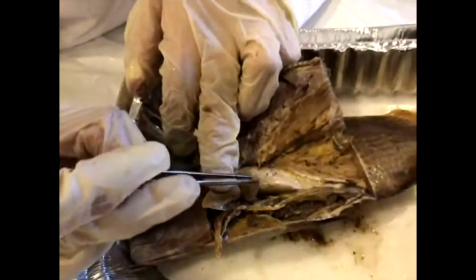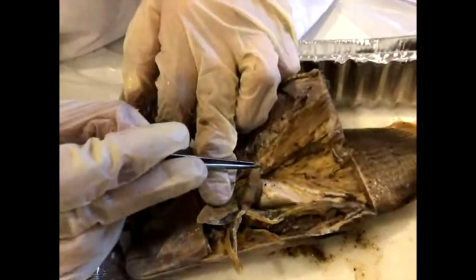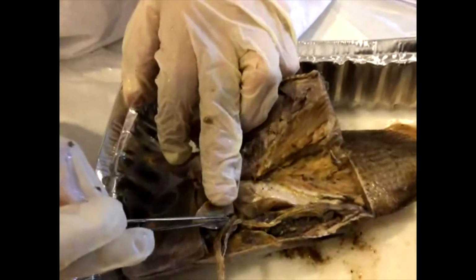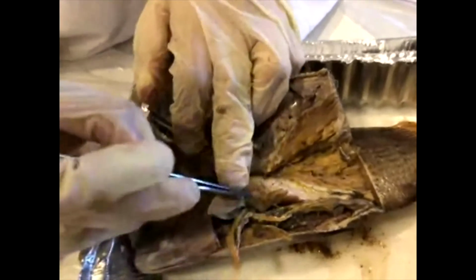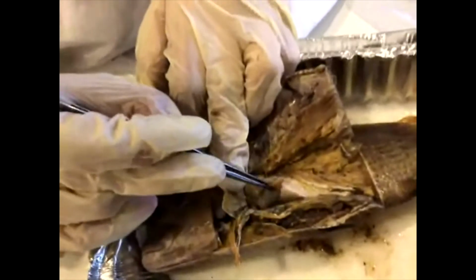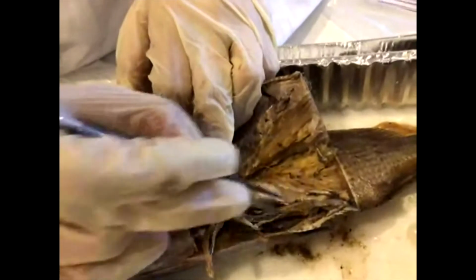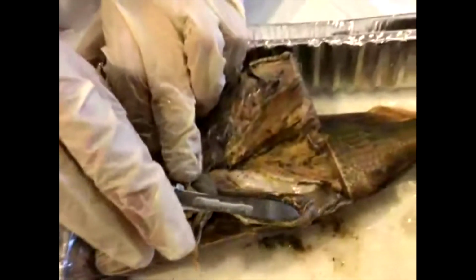So this in theory could probably expand quite a bit more if the fish had some food. But sometimes they'll have a few other lobes. Now, the stomach is mostly for storing food, and the liver will actually put some enzymes and digestive juices into the stomach to help start digestion. So we've got this here, and then if we go even further, I'm going to have to make a few more cuts here, actually.